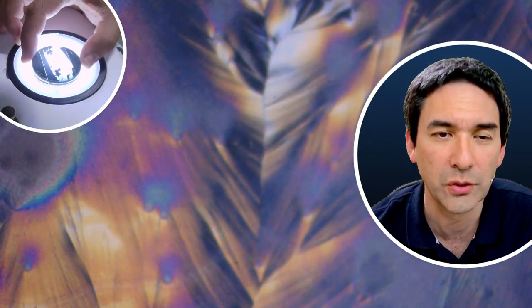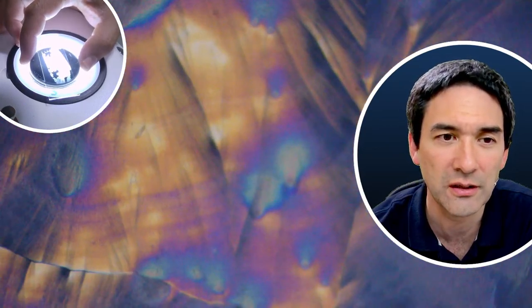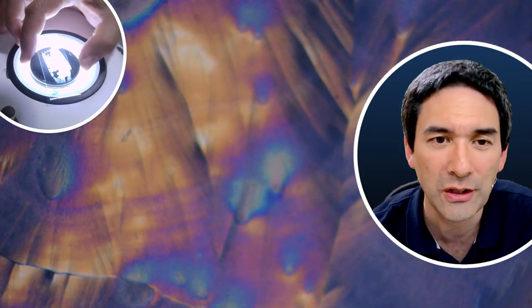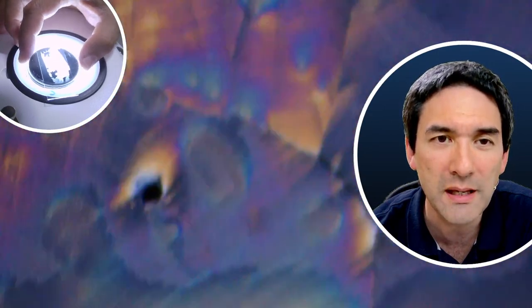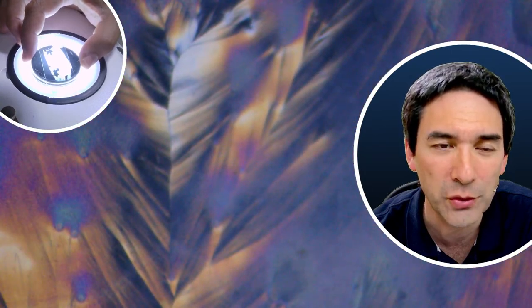That's one of the first, it's a classic, so to say, vitamin C, because the colors and the patterns that are created look quite a bit like modern art, very beautiful. And considering the fact that it's so easy to make, I highly recommend that this be one of the first things that you try out.